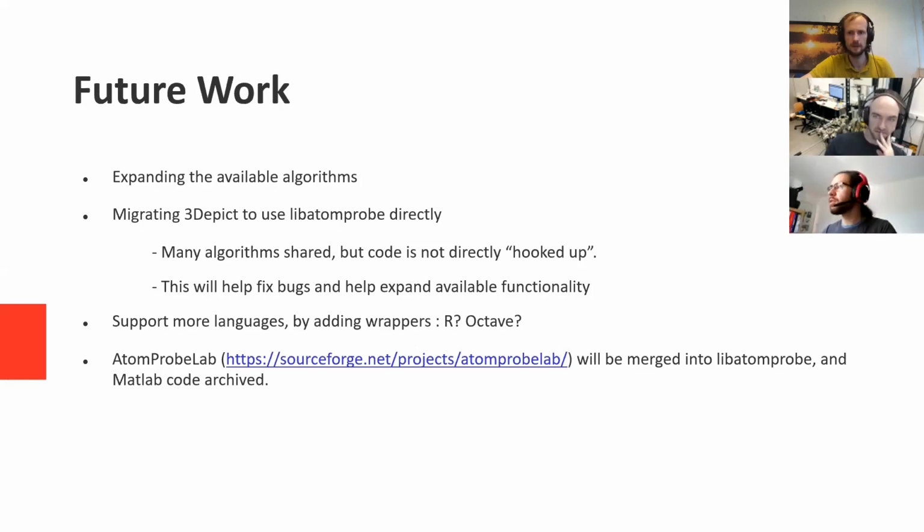Ask a quick question, Andy. It's Tim from Cameca. Yeah, go ahead, Tim. How are you licensing libAtomProbe? Is it something that we could use and distribute with... Right, so libAtomProbe suite? Yeah, so it's a GPL3 license, which means you're not allowed to sell it, but otherwise it's pretty permissive. So I think that you'd be able to use it as part of a third-party add-on that was available for people to download and use.